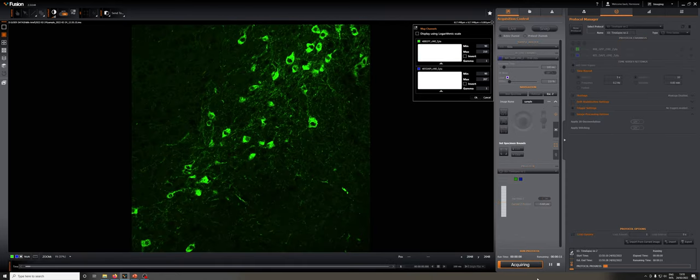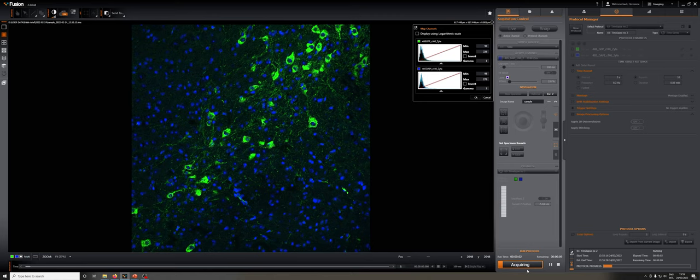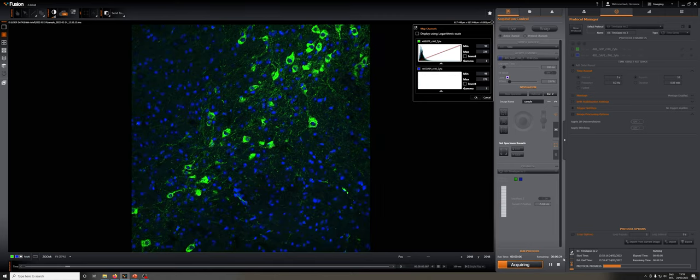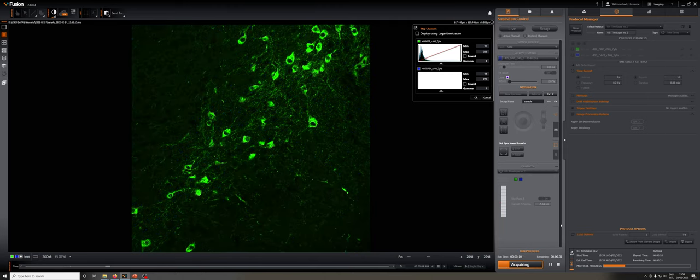And if I hit acquire it'll just take images one after the other. You can see that here it says how much time is remaining, and here what the runtime is.